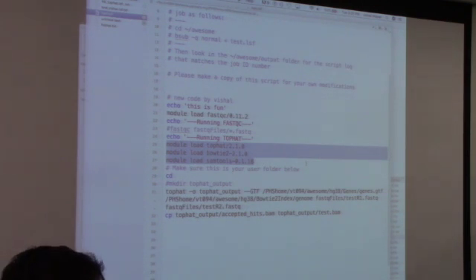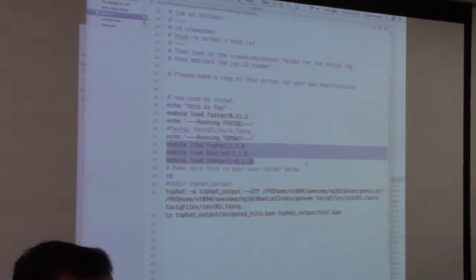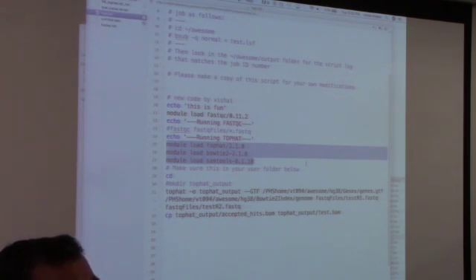Now I haven't taught you IGV yet, but basically, if you want to do the extra part, we'll do this later. If you're interested in trying something extra, the third part is the extra part, which I'm telling you verbally: download IGV from the internet and install it. It's literally like downloading any other software. Then open it, then load these two BAM files, which you will download from Iris1 onto your local computer. And you're going to see those BAM files in IGV.